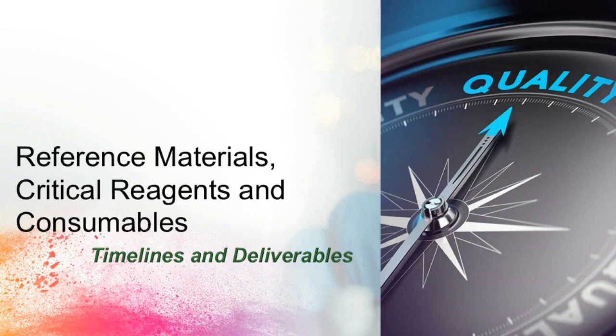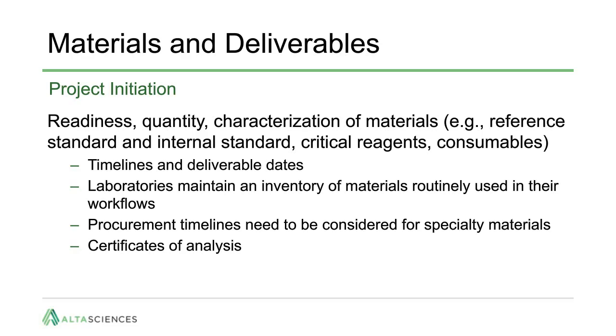The next section focuses on general considerations for materials as they relate to timelines and schedules. To initiate a project or a series of projects and lock in timelines and deliverables, the availability and quantity of reference standards, internal standards, critical reagents, and consumables needs to be determined.